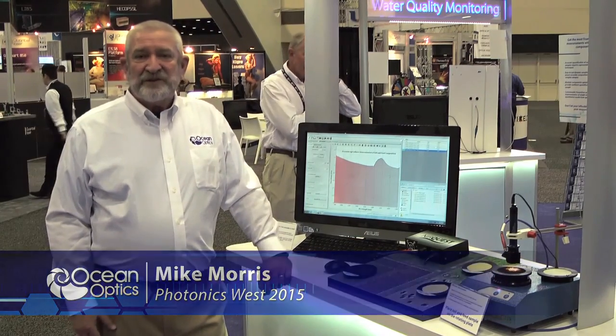I'm Mike Warris, I'm with Ocean Optics, and today I just want to show you how our modular spectrometer is now being used to analyze dirt.